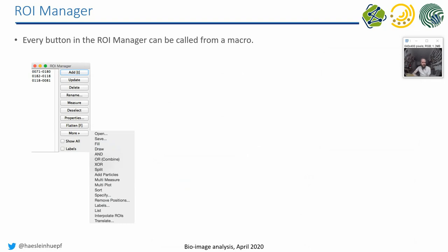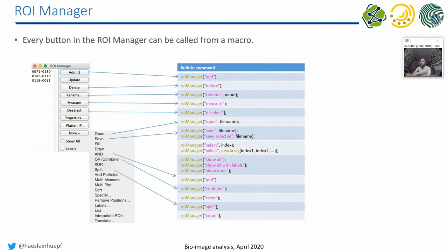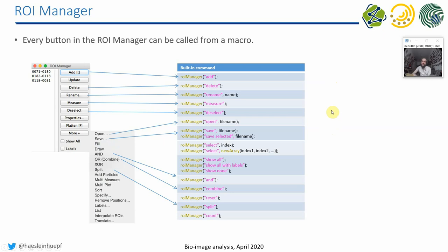And therefore, you may have done some of these operations already. It's good to know that every button or every menu you have in the ROI manager is actually programmable. So you see that when you record, you use the recorder by using the ROI manager.